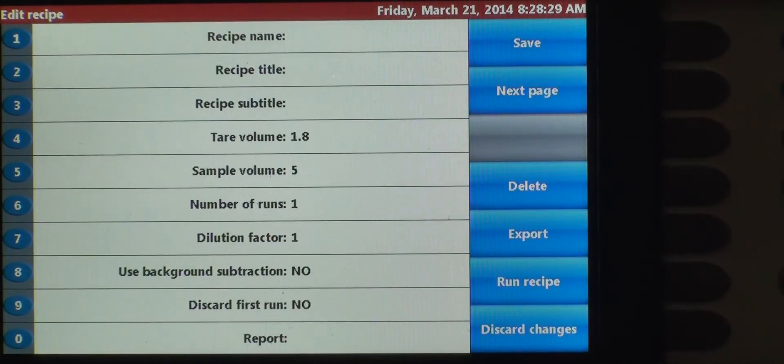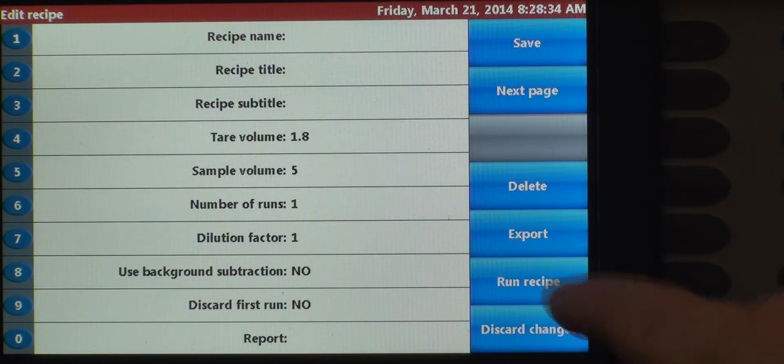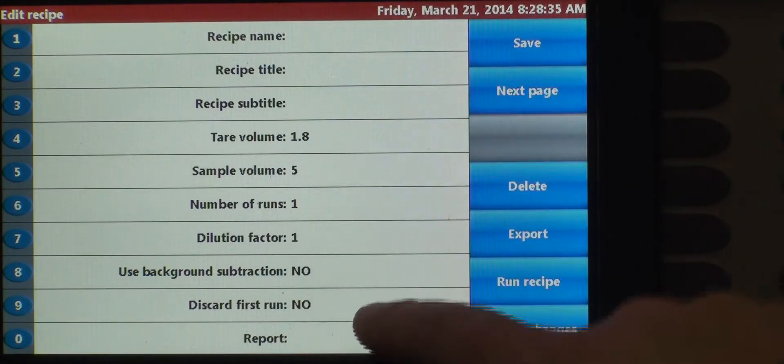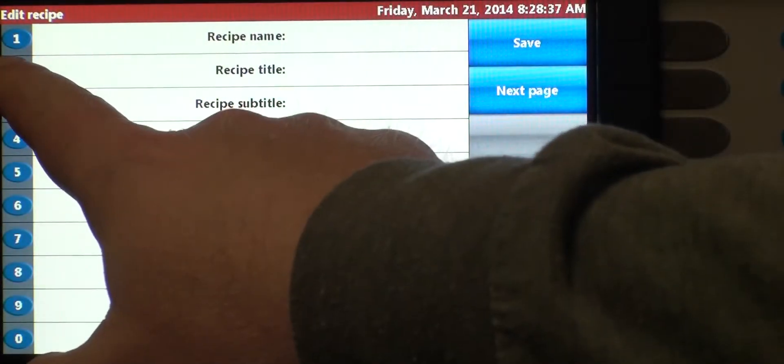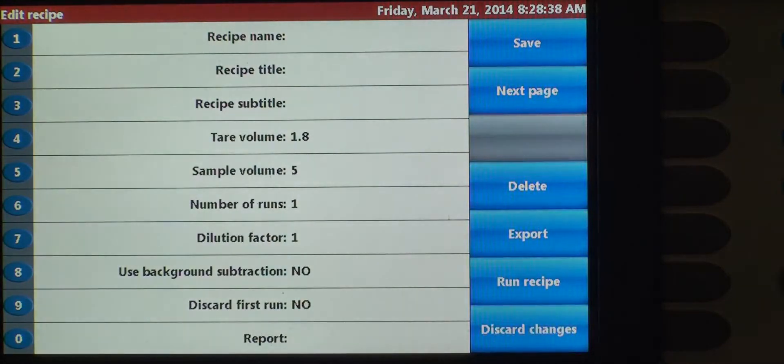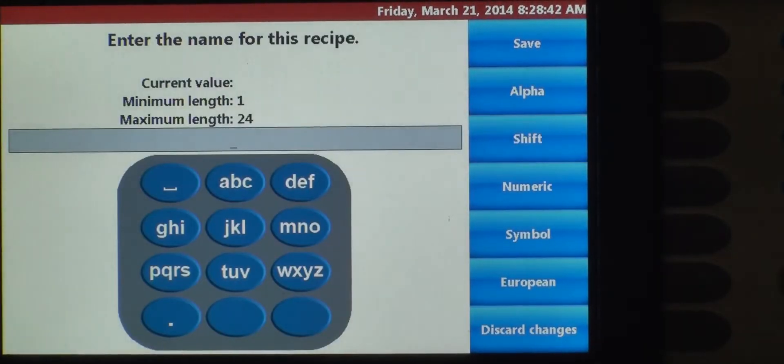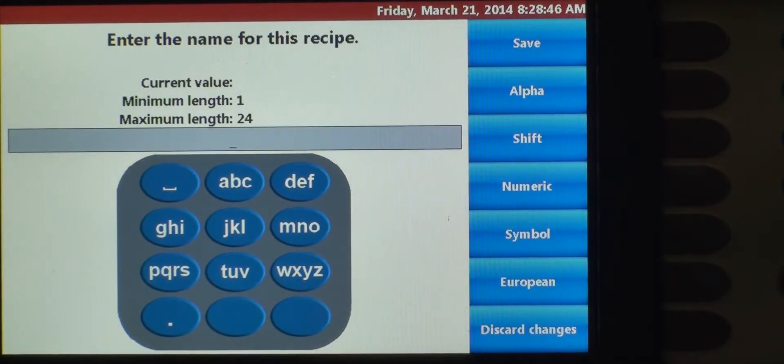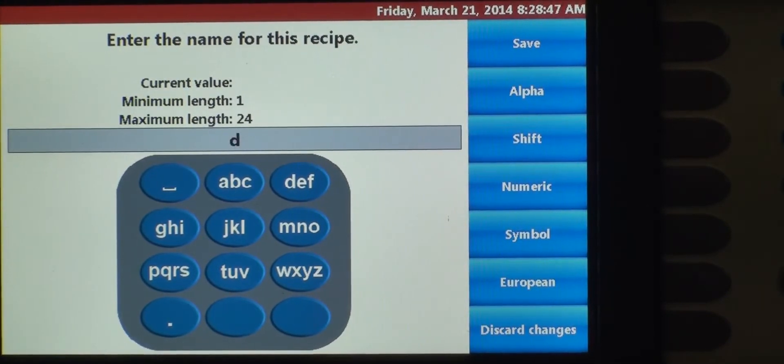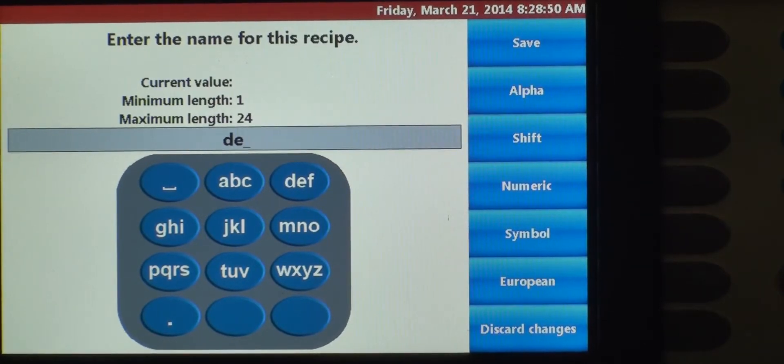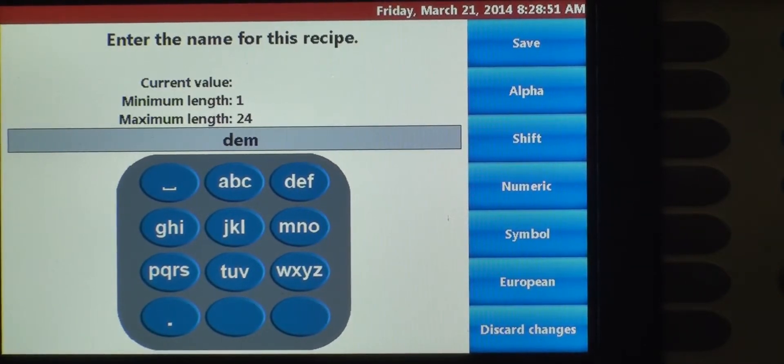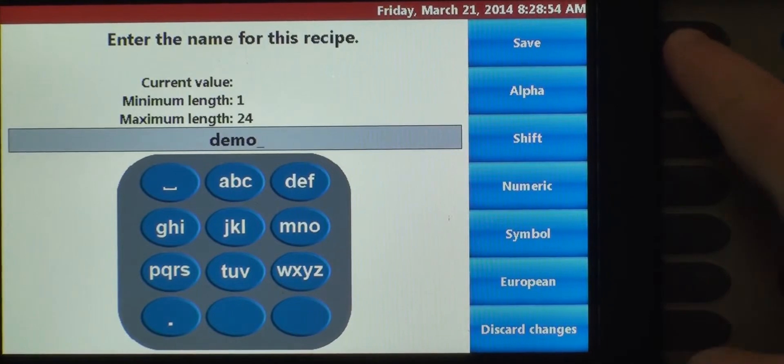This is the menu that you go through when you're setting up a recipe. It's very simple. To access each one of these, there's a corresponding number here. So to create the recipe name, we're going to number one. There's an alphanumeric keypad here. We'll just call this a demo. And we'll save that.